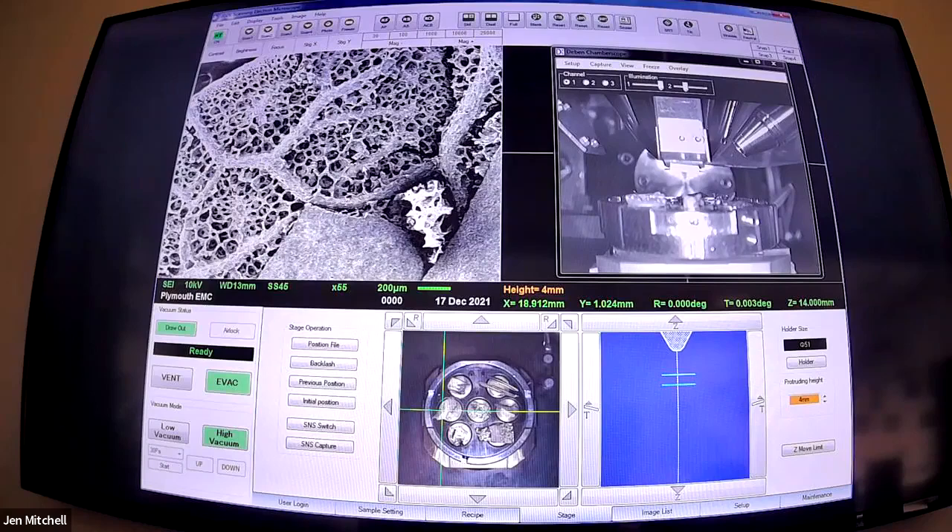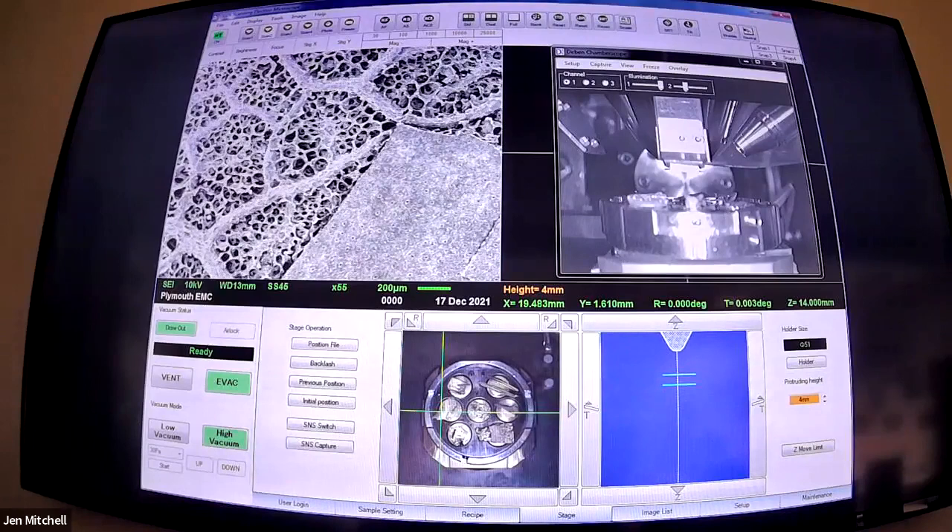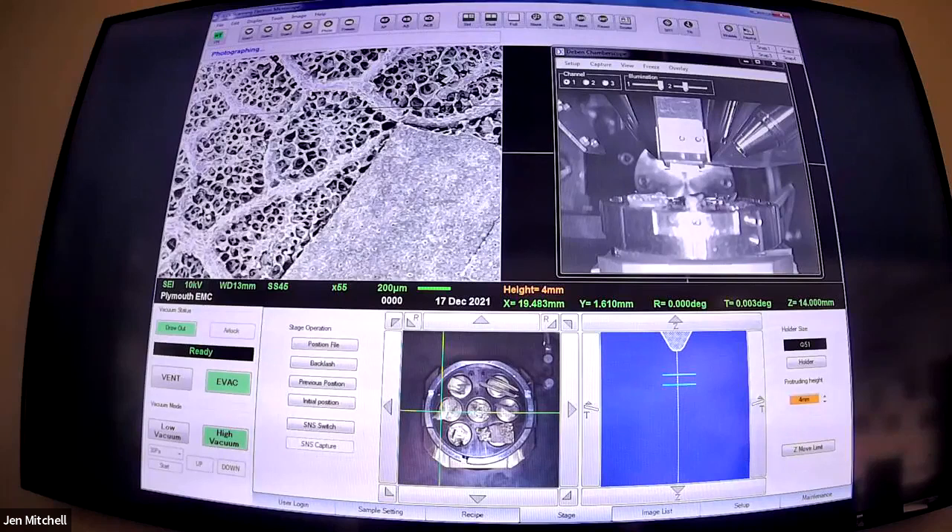We have freeze dried our leaves - we gave them a little bath in some liquid nitrogen, then my colleague Glenn sort of slapped it really hard so it broke. This kind of grey rectangle at the bottom is like the underside of the leaves - quite nice and smooth. This is the inner vascular system of the leaf. I do rocks, Tom does semiconductors, so we're digging on some very rusty biology, but I believe we are looking at some mesophyll - the inner structure. We're looking at the underside of the leaf where it's been shattered open, so you've got these spongy areas that allow the air to pass through. Because we've lost all the water, you can see how open it is now.